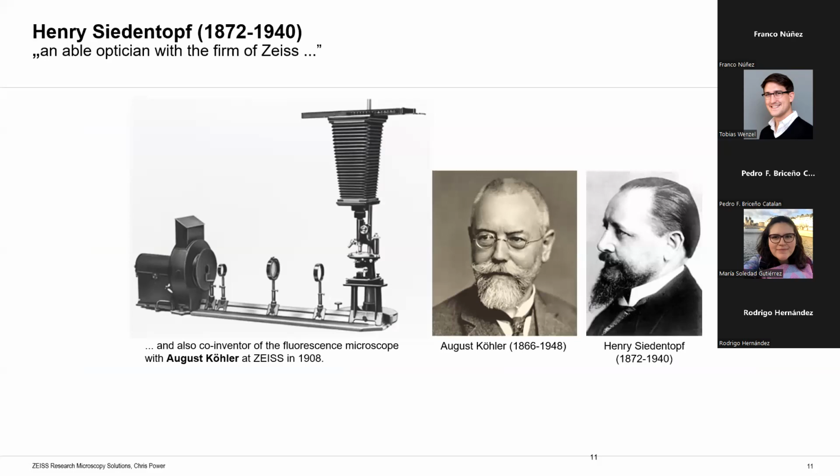Now, fluorescence microscopy went in a completely different direction. And they kind of gave up on this horizontal design for many, many years. And fluorescence microscopy became the big thing we know today. But light sheet disappeared, or so we thought. It kind of meandered into different industries. It went into looking at macro studies, so fish tanks meters in size. And then it moved into the industrial environment, where it was used to do things like looking at shipbuilding.